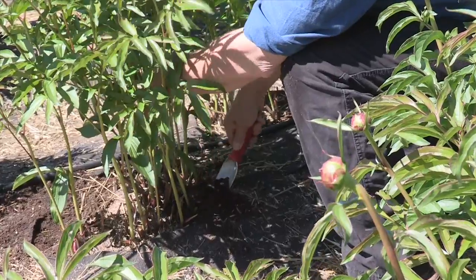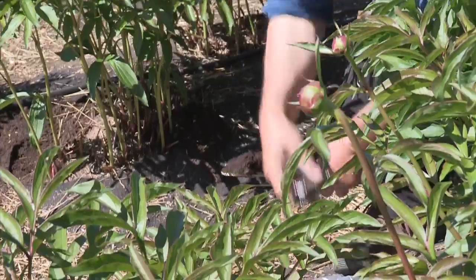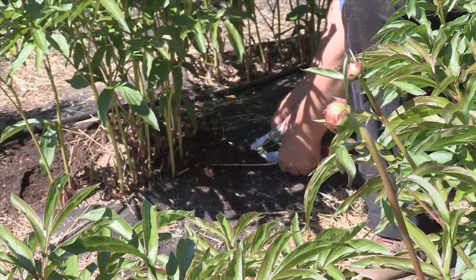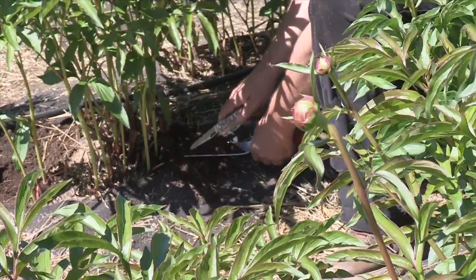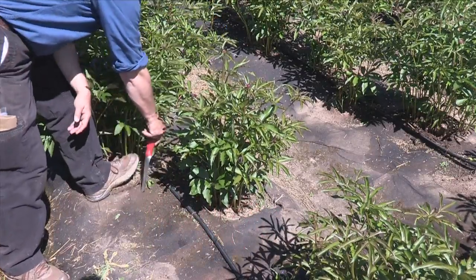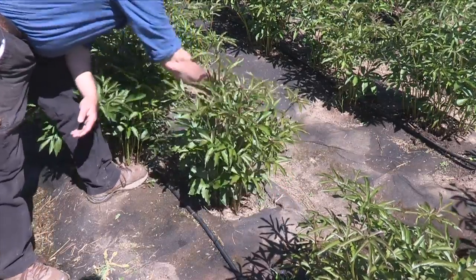Most of the original fertilizer additions were added to the same hole as the root at planting, and any subsequent fertilizer additions were most likely added to the soil surface near the base of the same plant. This soil nutrient reserve is why we need to get soil samples from as close to the plant as possible. Established peonies can have root systems that extend as much as 2 feet in any direction, which is why care must be taken when sampling.